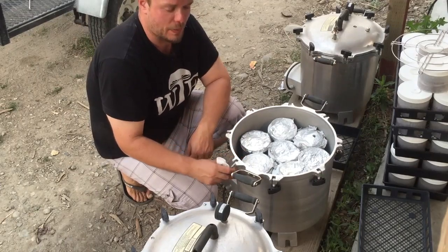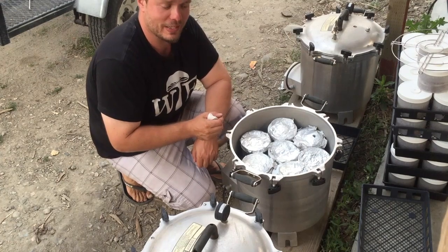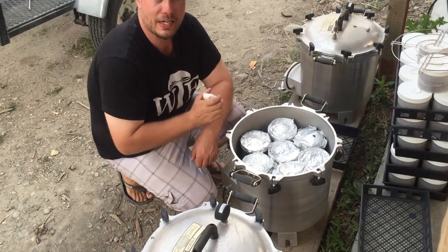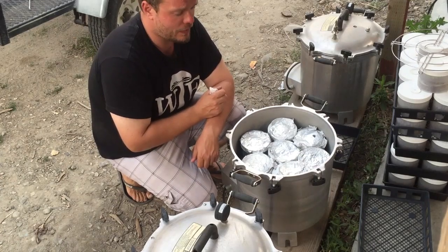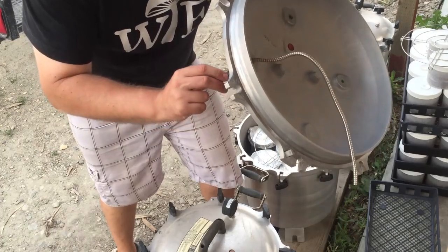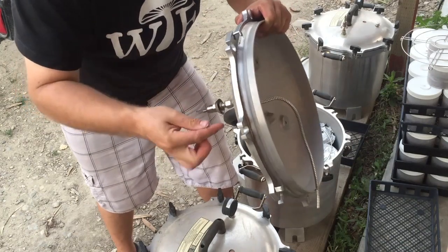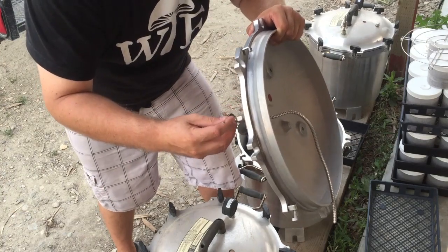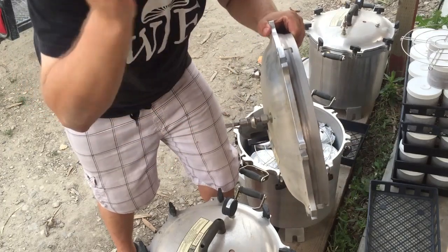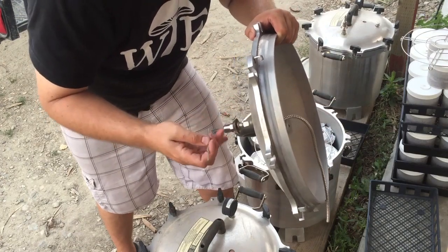We're going to get the lids on, bring these up to temperature, get steam exhausting from the stopcock for about 10 minutes, then close the valve and let these pressurize to 20 PSI. There's a rubber gasket right in this stopcock that likes to get loose sometimes. You need to get a piece of clothes hanger wire, get in there, and just pop it back so you get a nice seal — otherwise air will escape and the unit won't pressurize. I just use a piece of clothes hanger and pop it back in. Good as new.